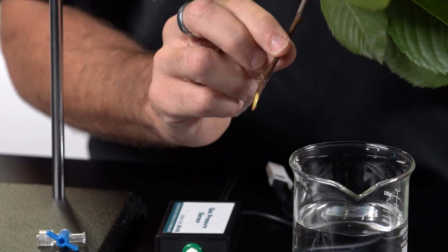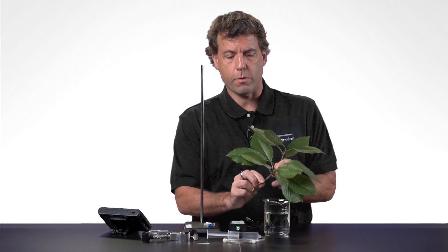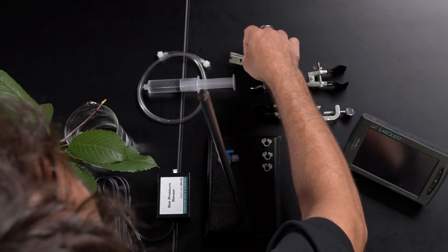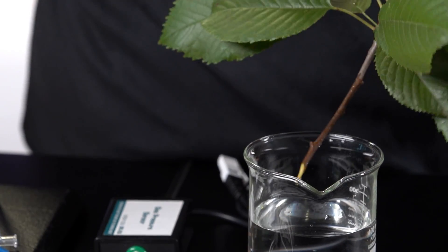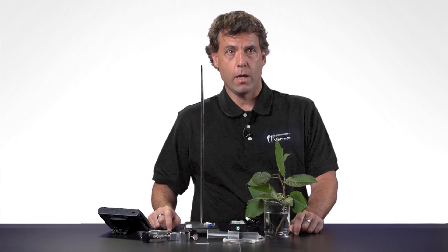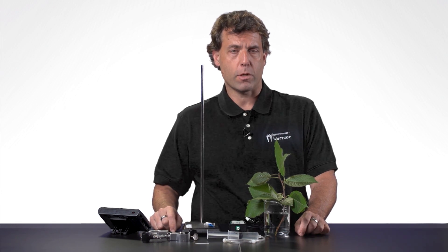This is a fresh cut limb, a small branch, from a cherry tree. The next thing you need to know is that you need to make a very fresh cut of the woody stem, and I like to use a razor blade. You want to cut that at an angle. Then you can just place it in some water and let it equilibrate and sit. The reason to use a razor blade is because you can make an angled cut without crushing the limb.